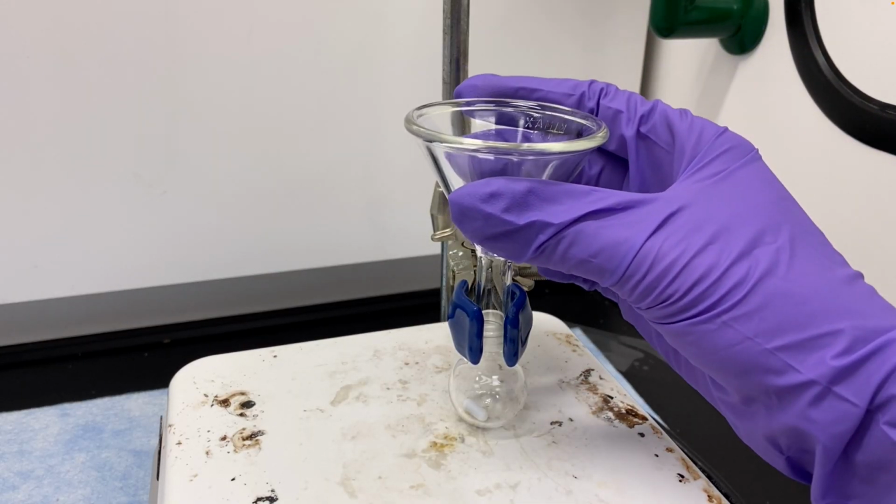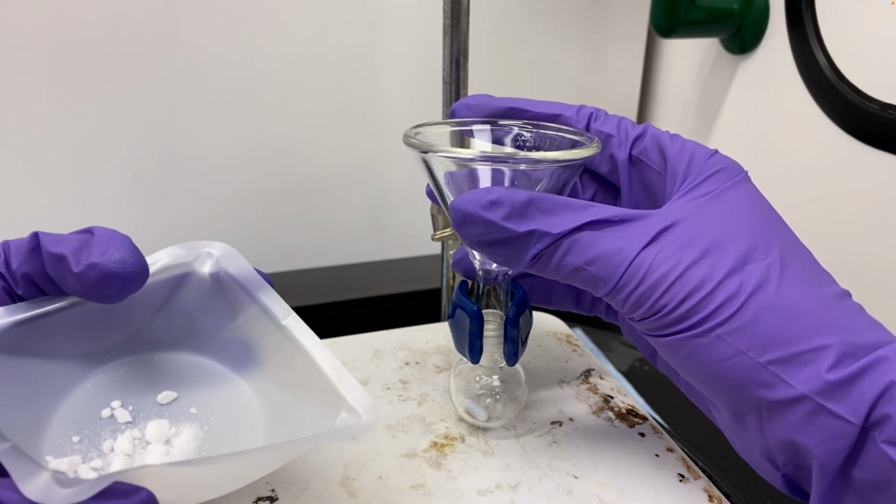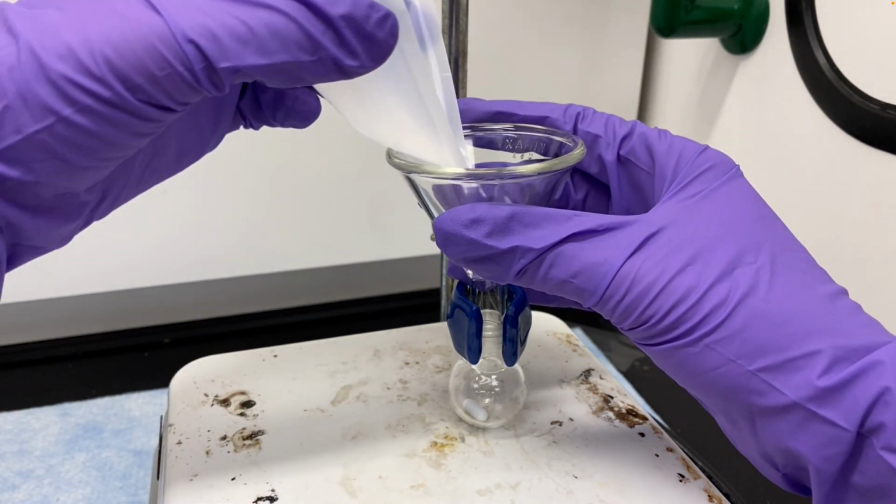When you add a solid to a reaction flask and you use a funnel, make sure you use a powder funnel. A powder funnel is different from other funnels because the stem of the funnel here is wider. And so if you use a funnel with a thinner stem, the solid will get stuck in the stem instead of adding to your flask.